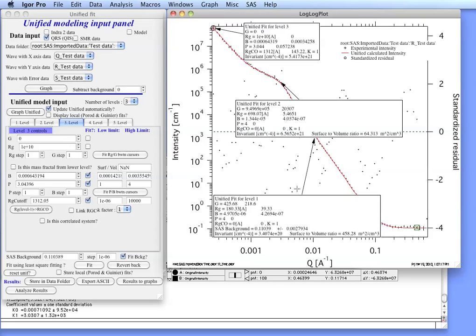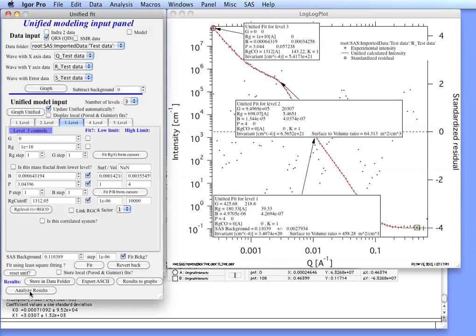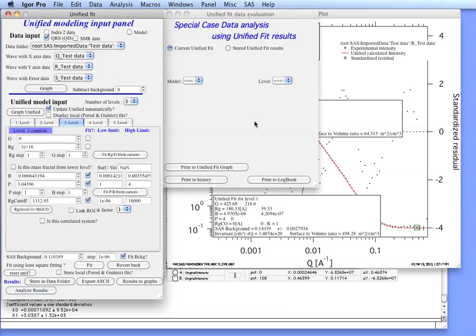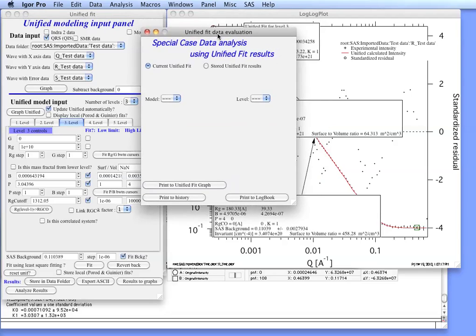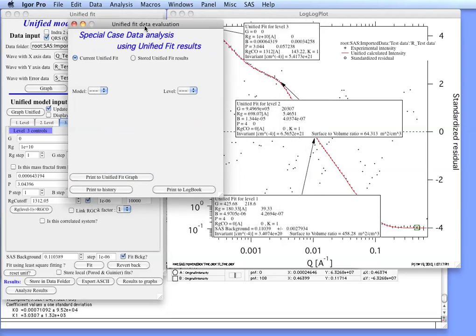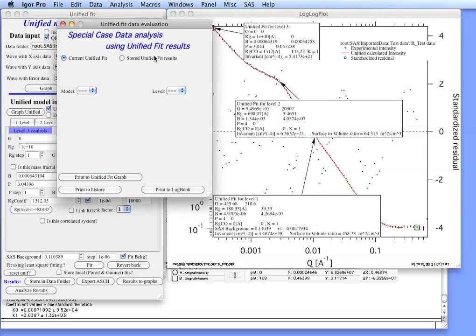This is what the unified theory provides. There are some specific cases where you can get slightly more values and they are available to you in the tool called Analyze Results here. If you click on the button you are going to get a new panel and you can either analyze the current unified fit results or you can actually analyze the stored unified results.